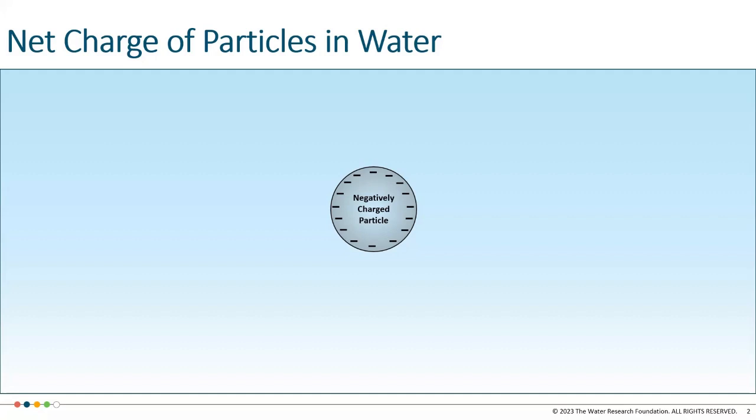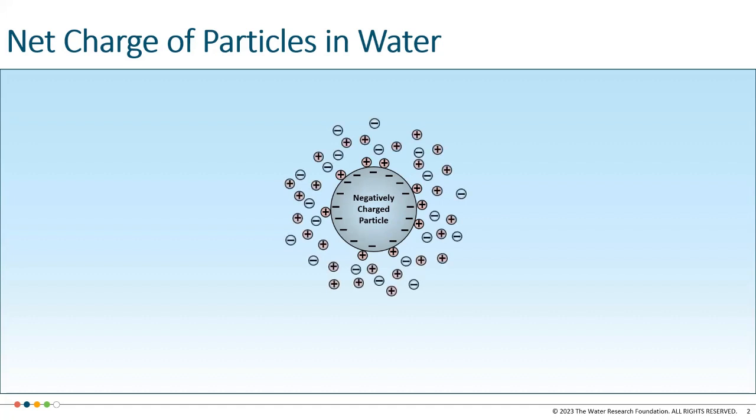So as we might imagine, negatively charged particles attract ions and macromolecules of opposite positive charge, typically a compact layer of immobile ions that are strongly adsorbed to the surface forms. And so there we've got our positive charge ions adsorbing onto the surface of our negatively charged particle. So this layer subsequently attracts a second layer of ions of opposite polarity. And that second layer is not as tightly held as the inner layer. And there that layer is.